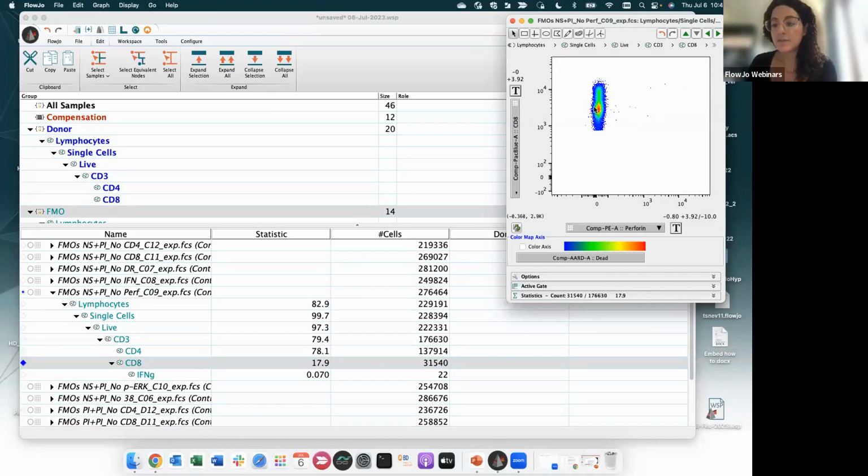In this case, what I see is that my cells are all squished next to the 0. So I may want to look at my data in a better way without changing the actual data. FlowJo allows you to transform the axis without transforming the data itself. If I want to spread this population a little bit more, I can transform the axis on the T button right here, and I could move right away from linear to logarithmic, or reset the axis, or I can customize them.